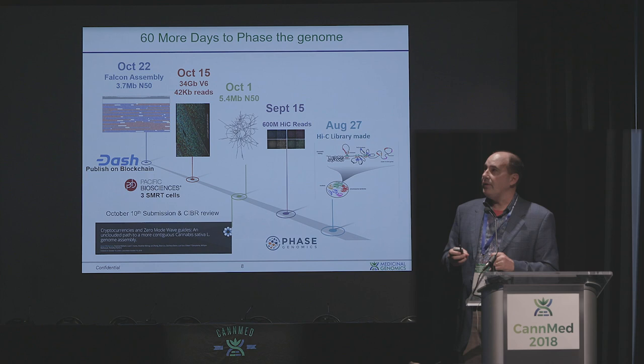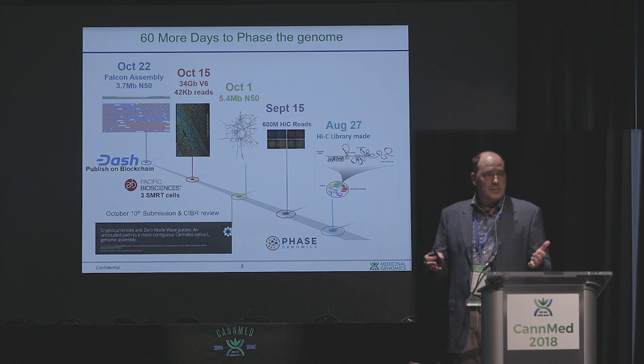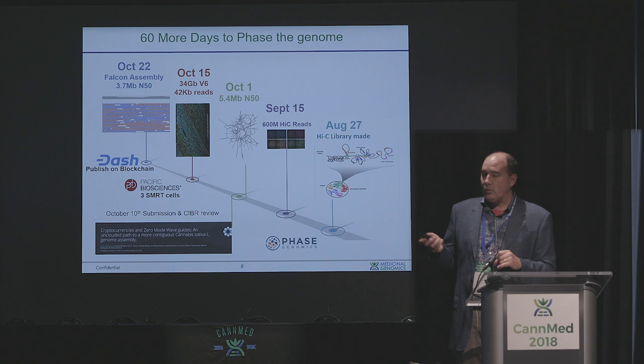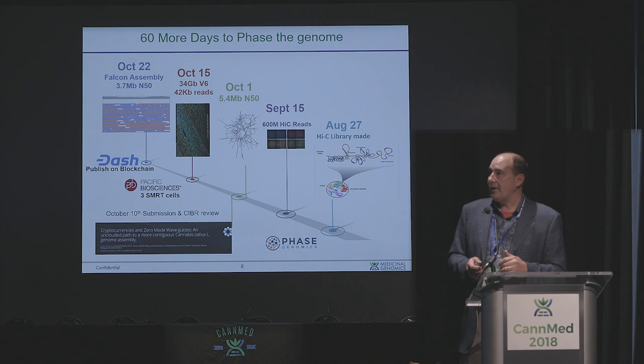So this went into another assembly, a Falcon assembly, and this raw assembly, unscaffolded without any of the Hi-C data trying to glue the contigs together, came out at three times this one megabase club, right? We're at 3.7 megabases of just the PacBio data alone, and that is fantastic. To give you some perspective on where that is, here's a slide showing where all the historical assemblies were. And then, of course, we quickly uploaded this to a preprint server because our funding cycle was ending by the end of October, and we really wanted to have the chapter closed from start of funding to end of funding. We're going to have a preprint out that represents all this data.